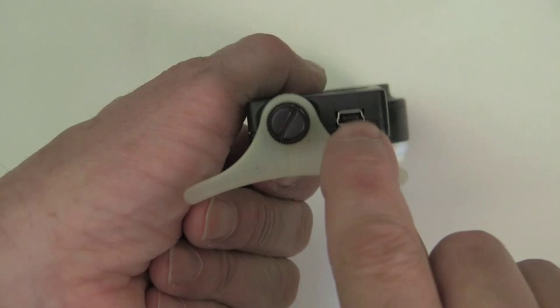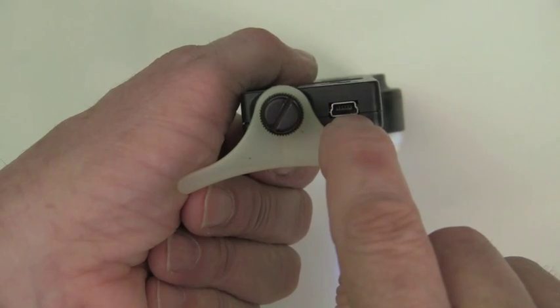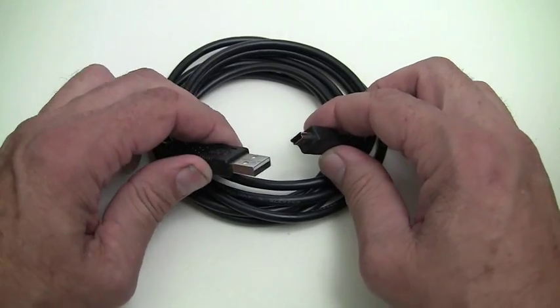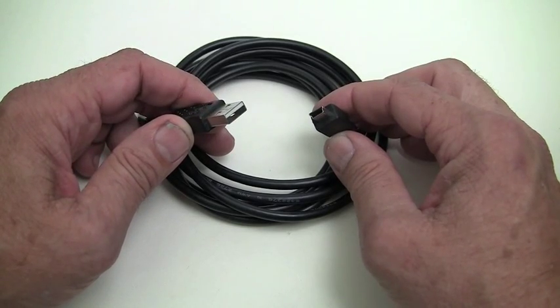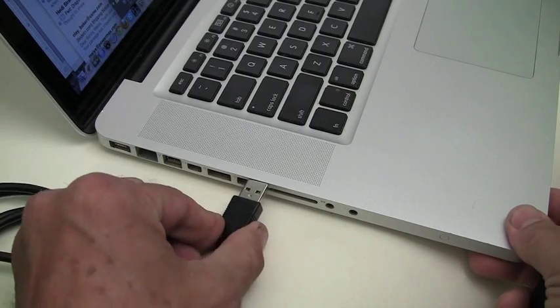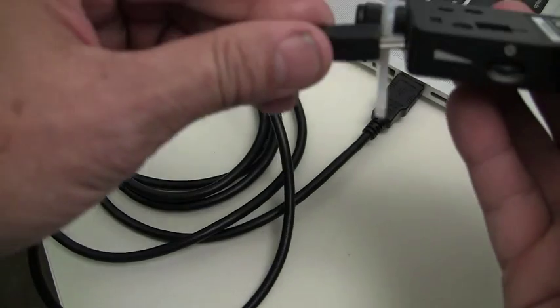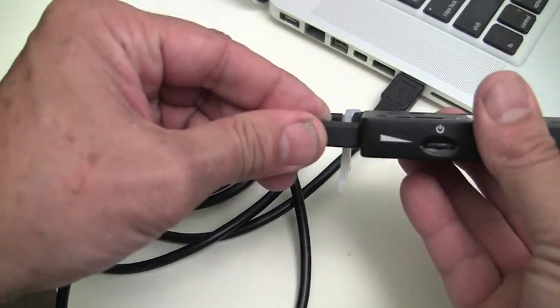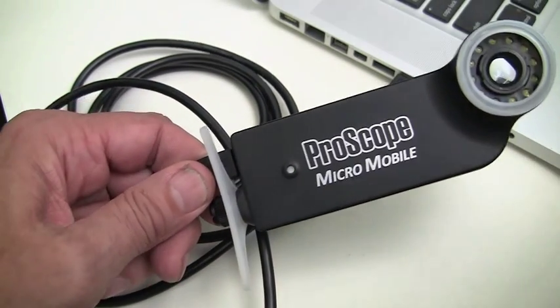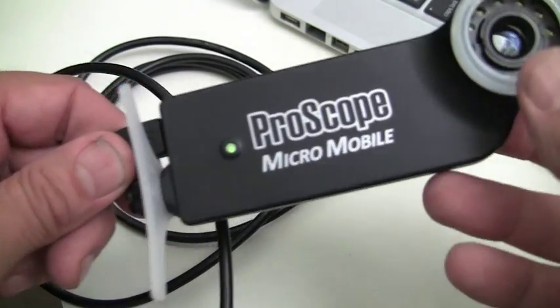If you've been using your ProScope MicroMobile with the LEDs for at least five hours, then you'll see the power indicator change from green to yellow and then red. It's time to charge it up by using the included mini to USB charging cable. Just plug it into a USB port on your computer or plug the USB into a USB to AC adapter. The power indicator light will begin to pulse and, when fully charged, will remain solid green.